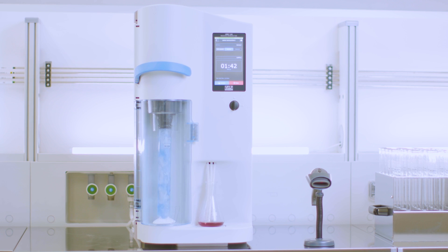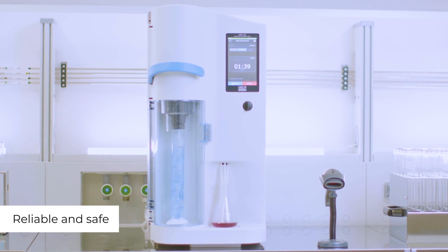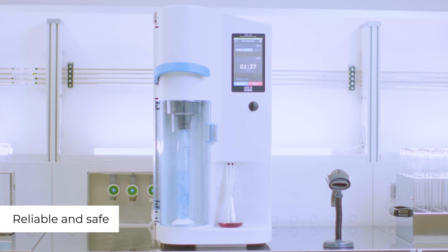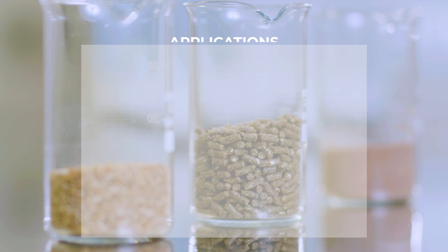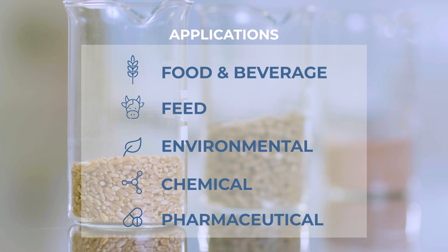The UDK 149 provides accurate, precise, and reproducible results to laboratories requiring reliability and safety in the food, feed, environmental, chemical, and pharmaceutical fields.